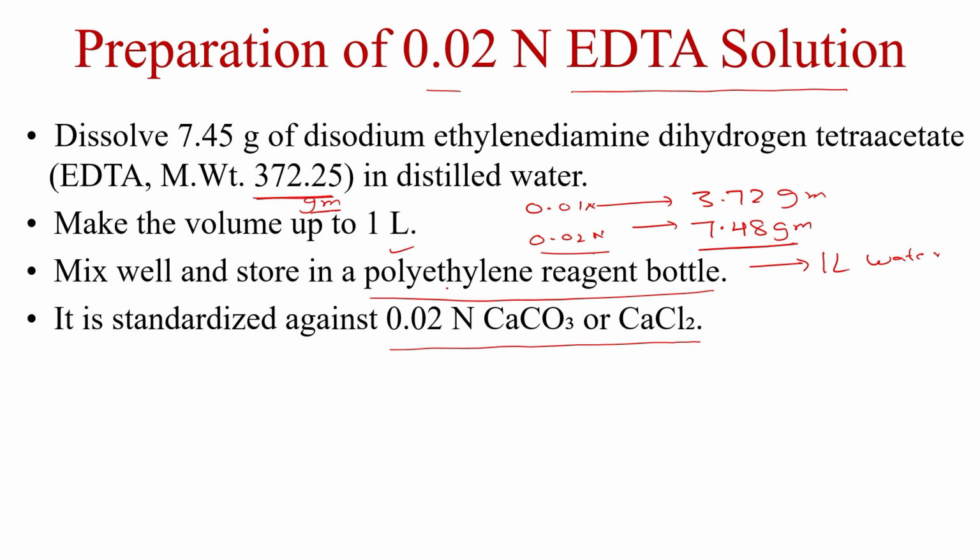So one point to note is why we make use of a polyethylene reagent bottle and not a glass bottle: because glass also has ions, like sodium and magnesium, so we prevent it.